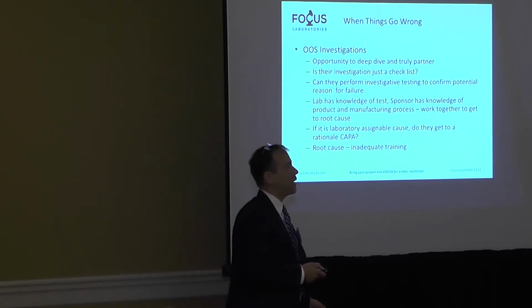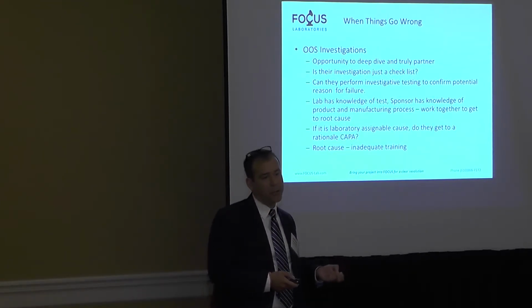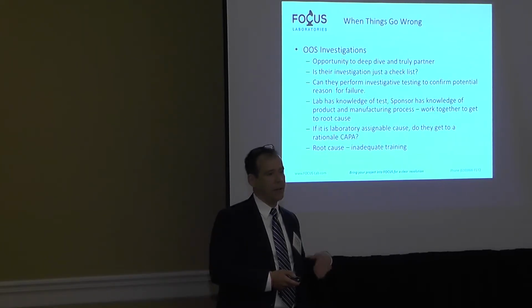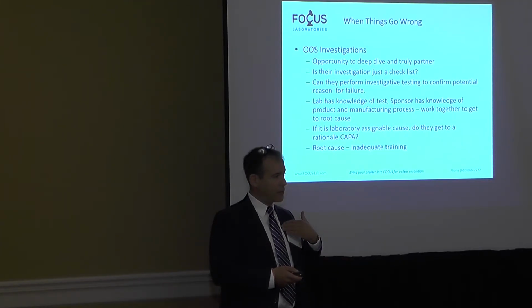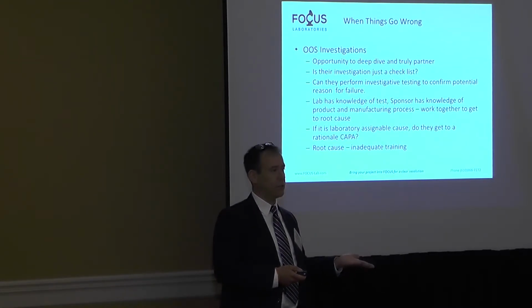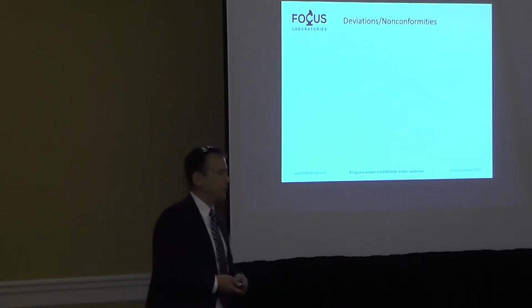So if there is an assignable cause, do they get a very good CAPA? They get to the root cause. And if you get a chance to look at their trending, is it analyst error, analyst error, analyst error, lack of training, lack of training, lack of training? At some point that lack of training is a reflection on the lab, that they're not training right. More often than not, in my experience, it's a reflection on the analyst who just doesn't care, and needs to go. So you have to watch some of these root causes in these labs.